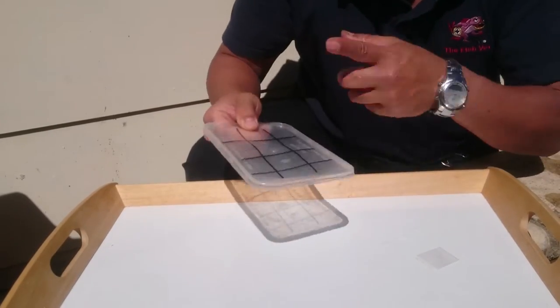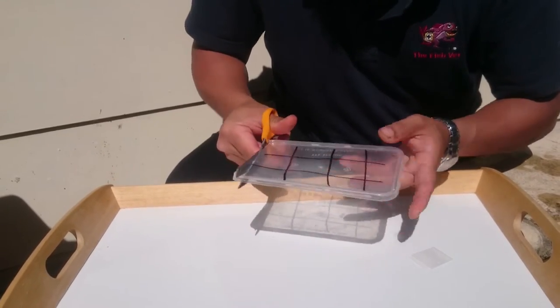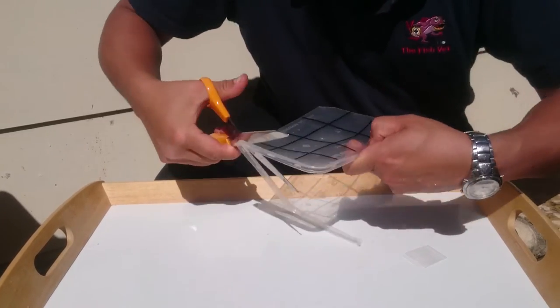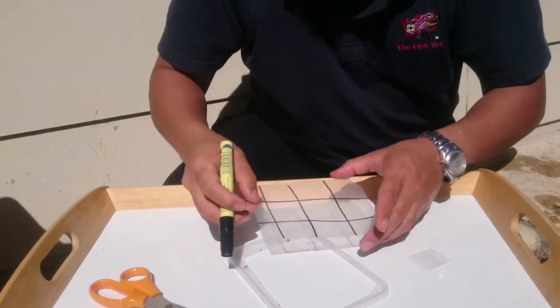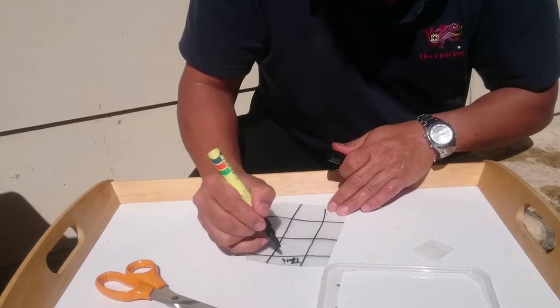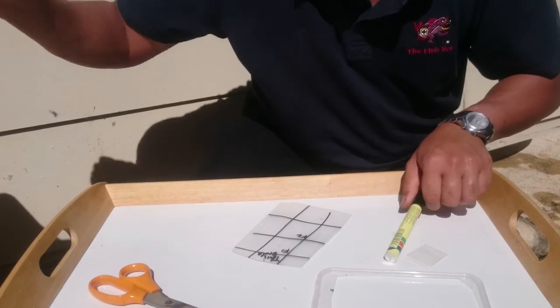Once you've done this and it's all completely dry, basically just cut out. You can also write on it so that I know which side the sample is on — this side — and this is F1, F2.